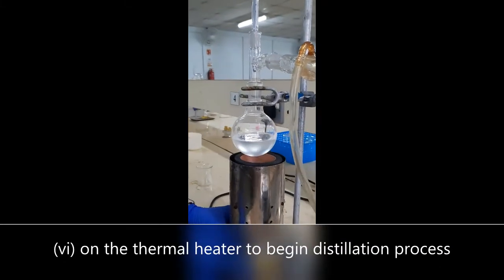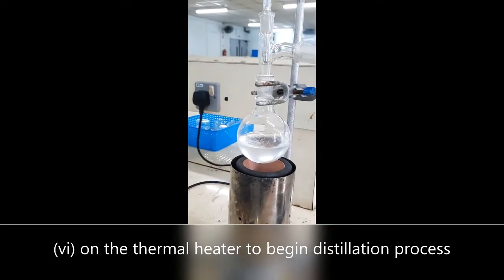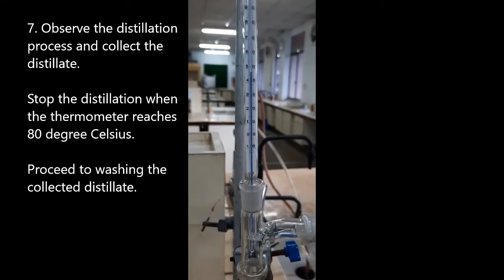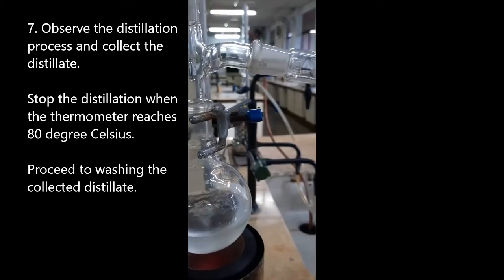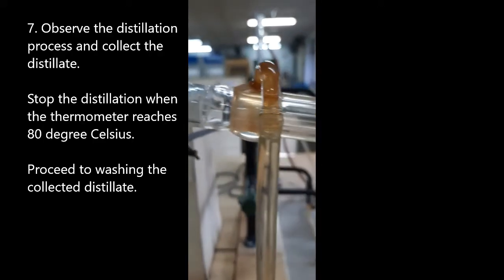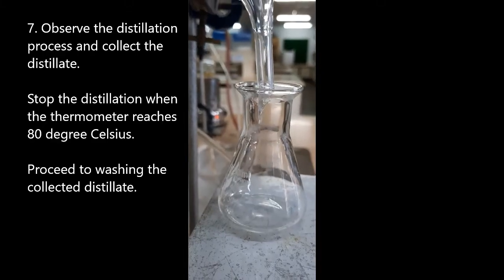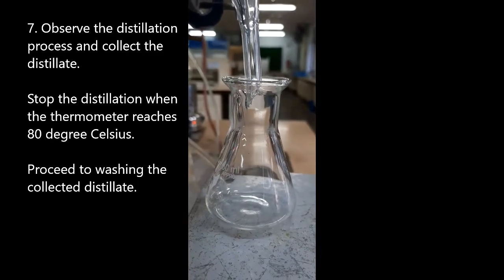Switch on the thermal heater to begin the distillation. Observe the distillation process and collect the distillate. Stop the distillation process when the thermometer reaches 80 degrees Celsius. Proceed to wash the collected distillate.